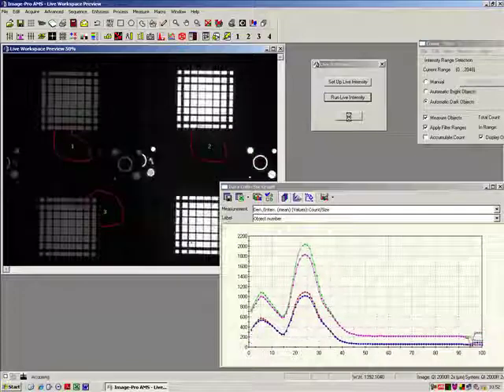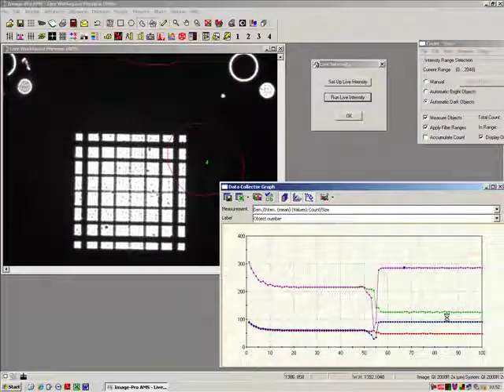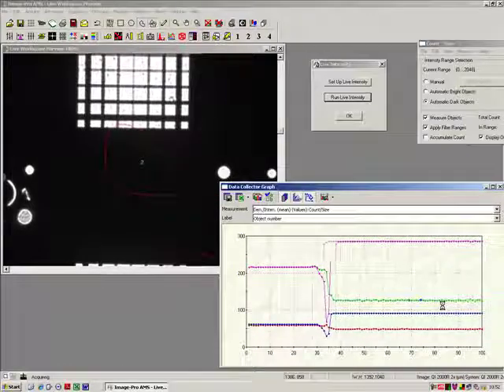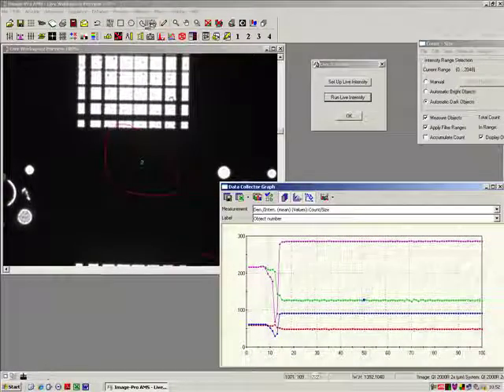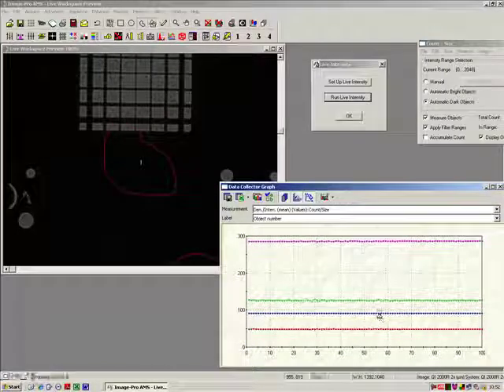So if I can identify an object, I can just say, okay, which one's the purple one, and I'll link it on the screen. Which one's that as well? So it's quite nice. It's actually scrolled and zoomed into that as well, so I can go and monitor each one of them as well.